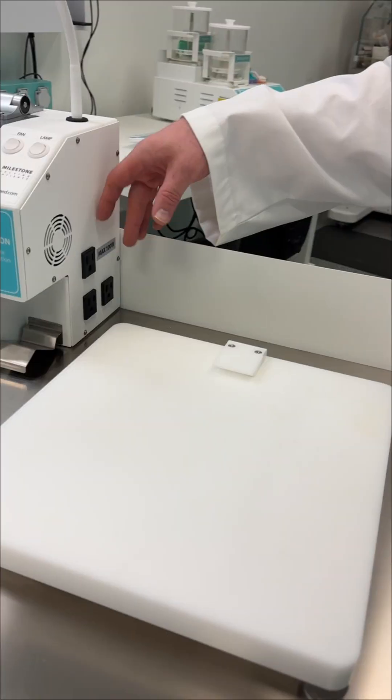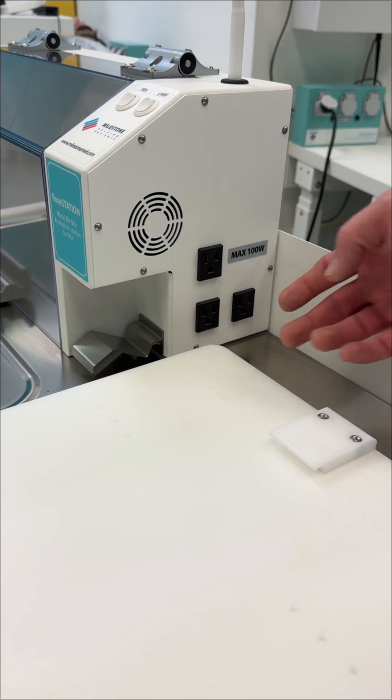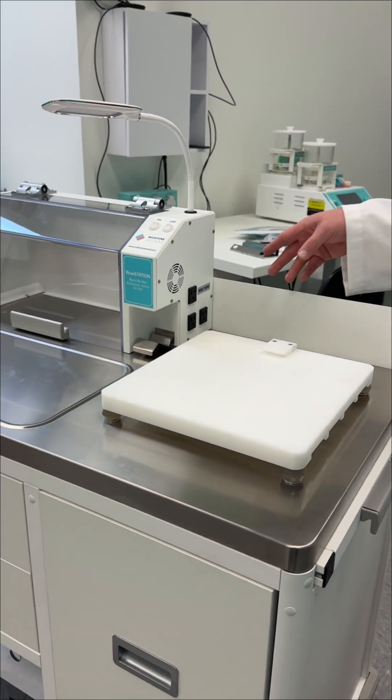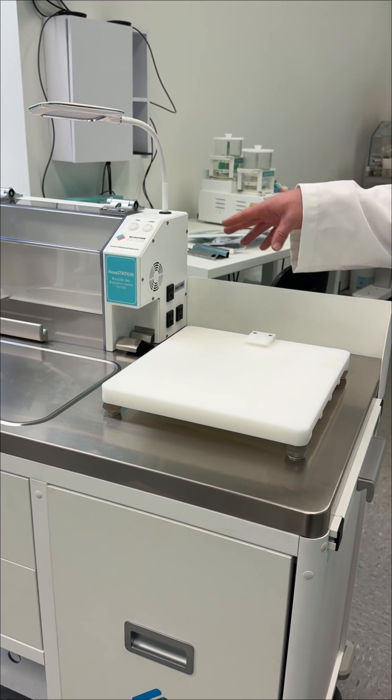On the side of the enclosure, there are three outlets. These are intended for anything needed during evaluation. Most commonly, a microscope and a laptop would be plugged in. The microscope mounts securely on this plate, which features anti-slip feet. There are also a couple of different options for securing the microscope firmly in place.